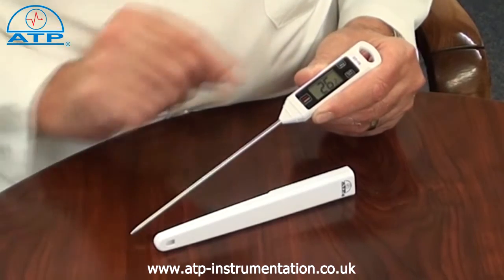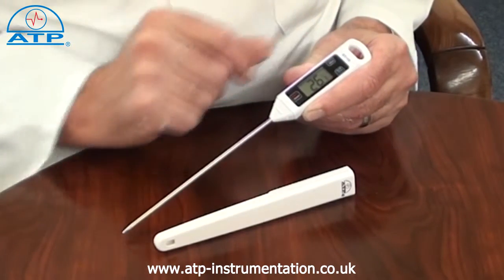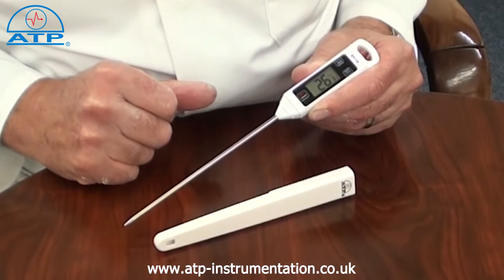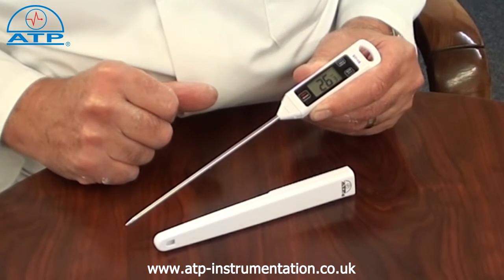The thermometer features data hold. When pressed, this will hold the displayed measured value even if the probe is removed from the sample.